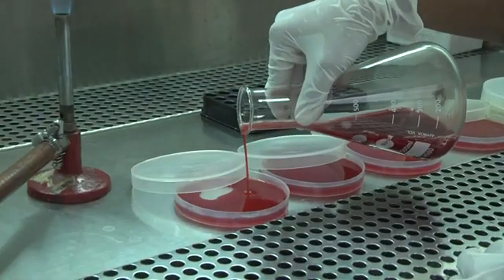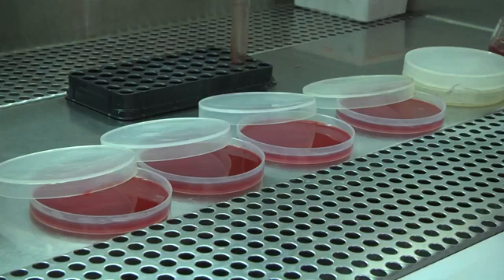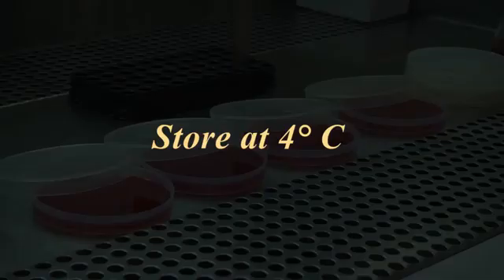After pouring the media into plates, leave them undisturbed till agar is solidified. Then, stack the plates and seal them in plastic bags and store at 4 degrees centigrade.